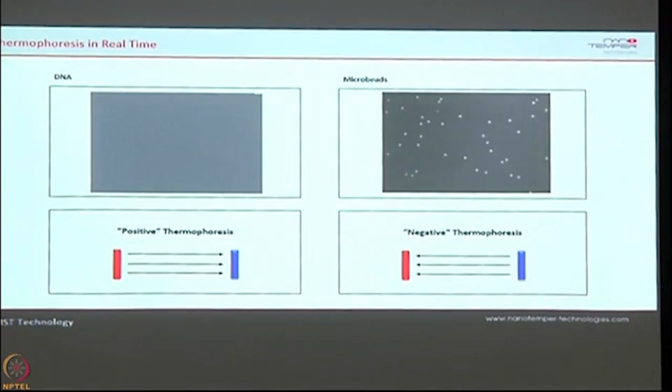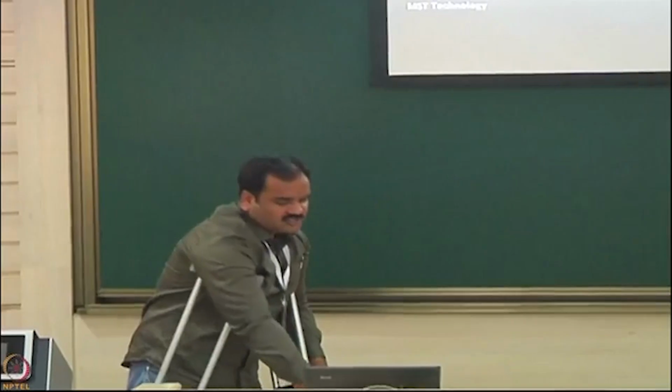Yeah. So generally, as I said, in thermophoresis, the moment you put in heat, all the molecules move away from the heat. That is a general principle. As you can see here, this is just a cover slip slide which has been coated with an LMU. The moment you shine a laser, all the fluorescent molecules move away. That's the reason why you are able to see the LMU. This is Munich University. That is called positive thermophoresis. The molecules moving away from the heat, which is a general property, is called positive thermophoresis.